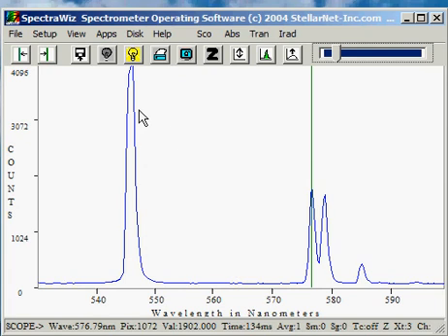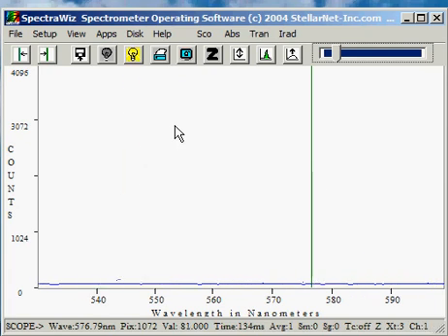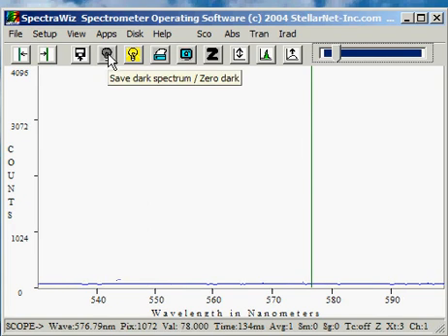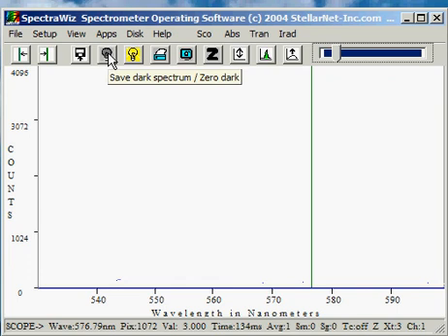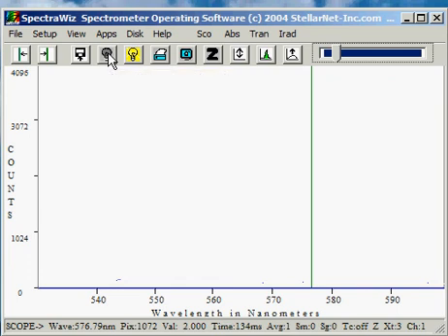If I turn off the mercury-argon spectrum lamp, I can now take a dark, which will automatically subtract. Or, if I right-click, I can clear the dark.